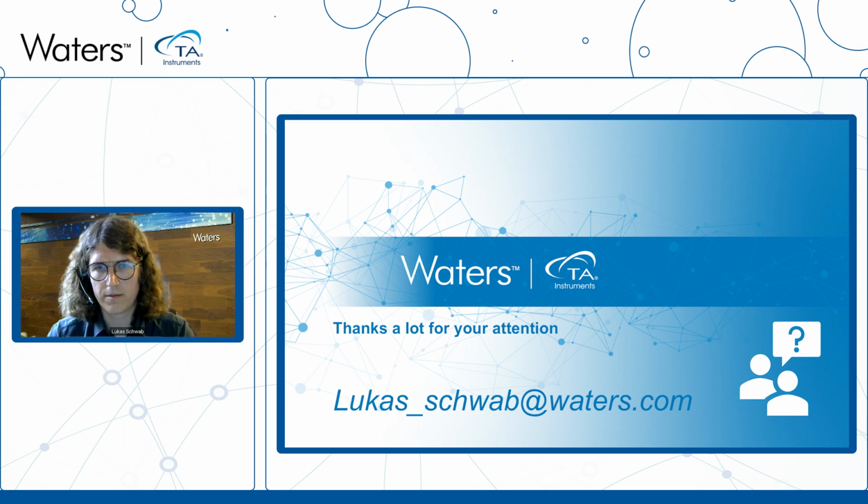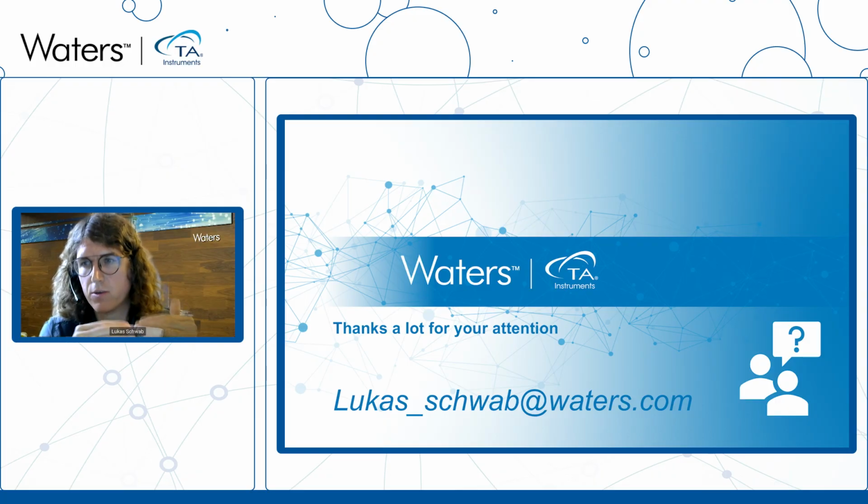Yes, that would for sure show up in the dielectric spectra, but there's one big limitation, and that is whenever you have drying in your sample, there might always be a volume change, and that might mean you need to change, on one hand, the distance between the two plates, which will also affect the electric response, but also you might even lose the contact.